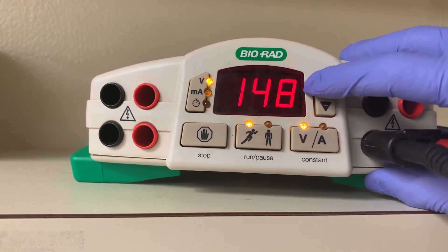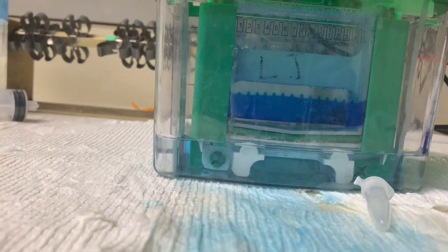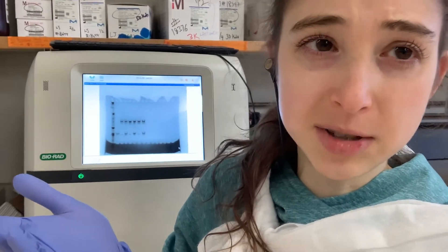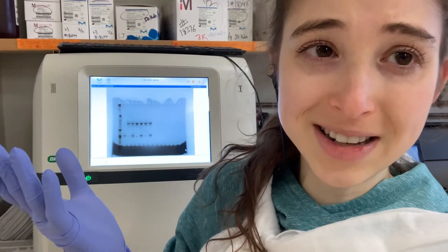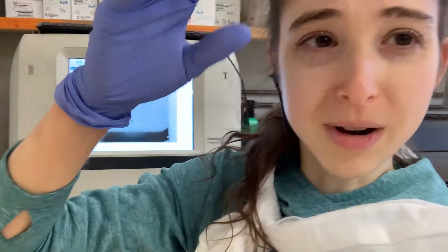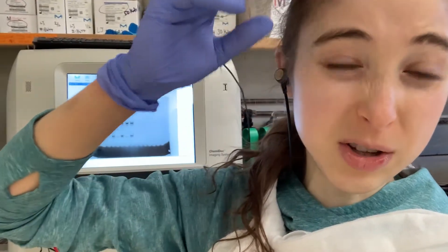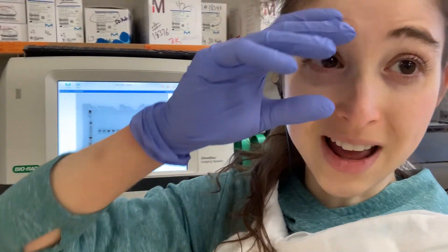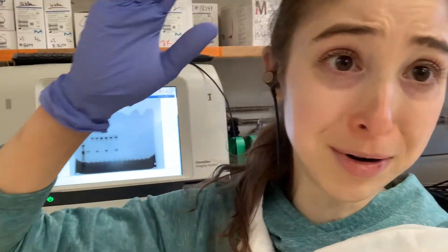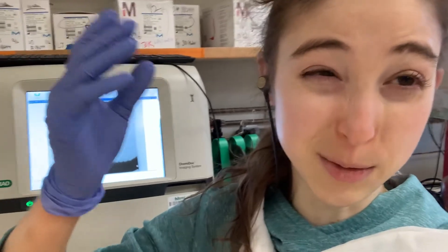I'm going to increase the voltage now because I'm getting impatient - I have a meeting to go to. Time to turn it off! So after running you can do a bunch of different things. I just stained mine to look at it and I lazy-stained it. Because you have the dye in the gel even though you replaced the buffer partway through, you're still going to have a dark dye band. Thankfully that's below the proteins I was interested in, so I didn't really worry about destaining before I stuck it in some quick stain.